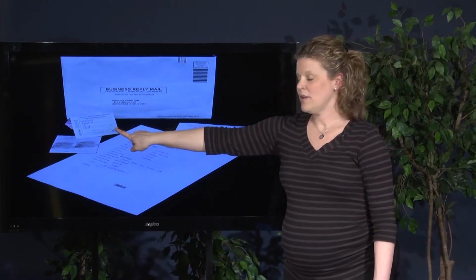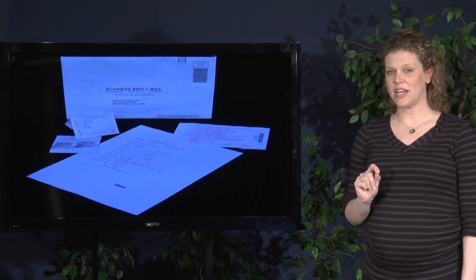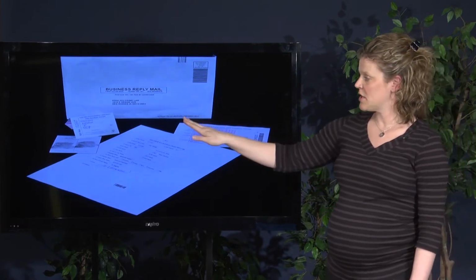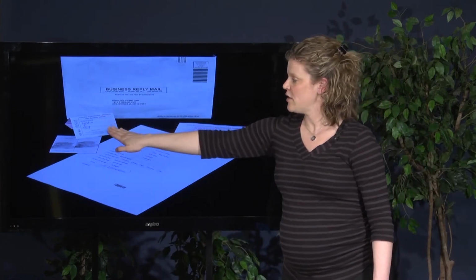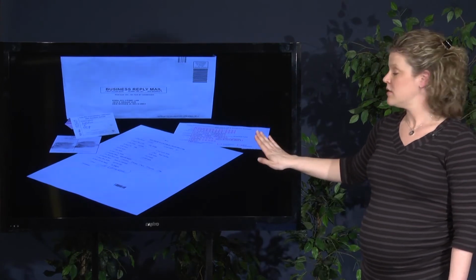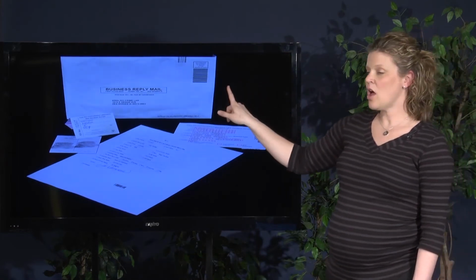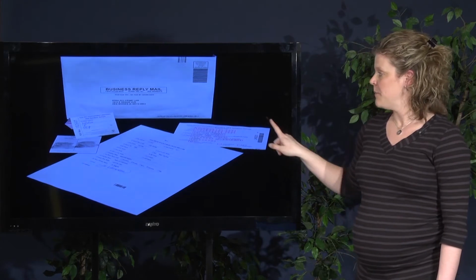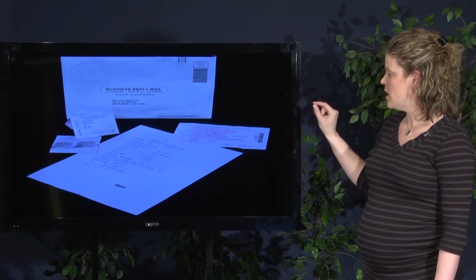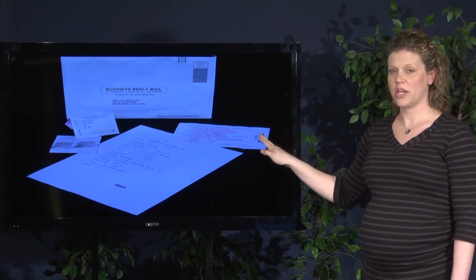Over here we have our new FTA buccal sample collection kit. You're going to use the swabs provided in the kit to collect a DNA sample onto that FTA paper. The fingerprints need to go onto the back, and the correct information for that offender needs to be on the front. You've got your electronic database card and your filled in DNA collection envelope. We've had a lot of questions on the fact that there's no longer an extra seal on the white envelopes. We did this because we have a seal on our DNA collection envelope. So we will have a sealed item that you can show that offender after you've made the DNA collection and put it into that collection envelope.